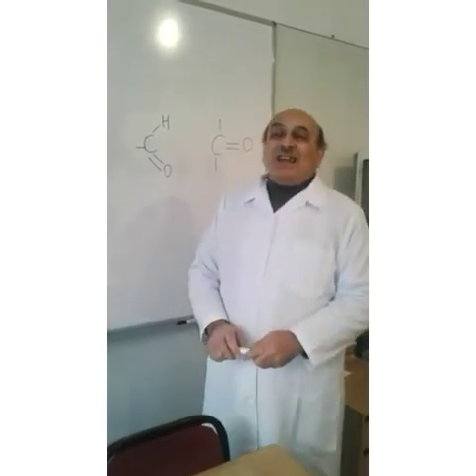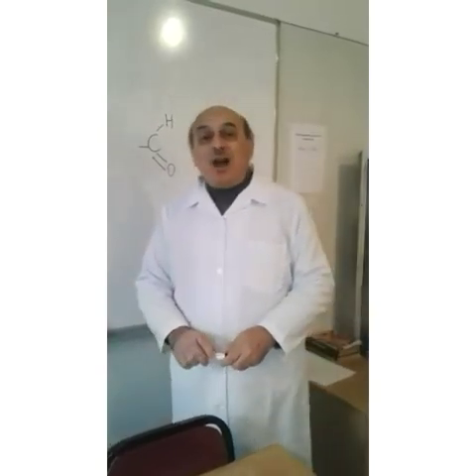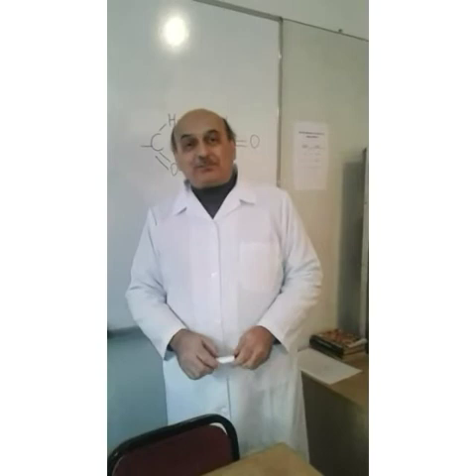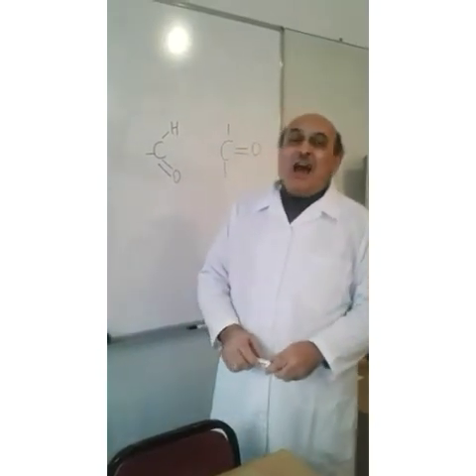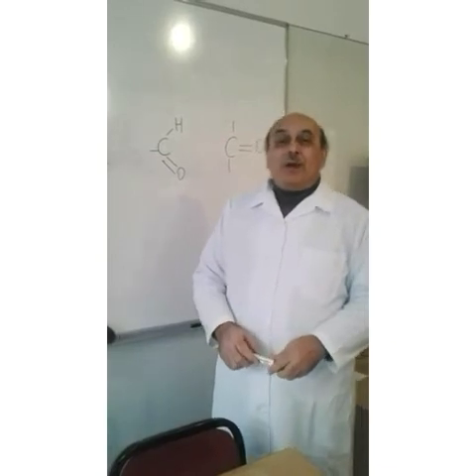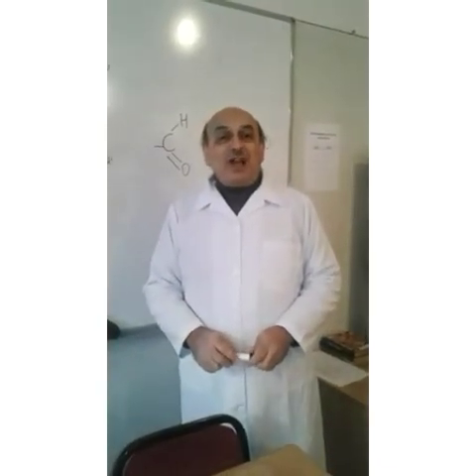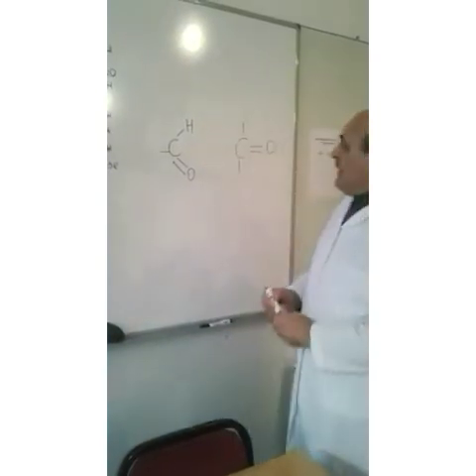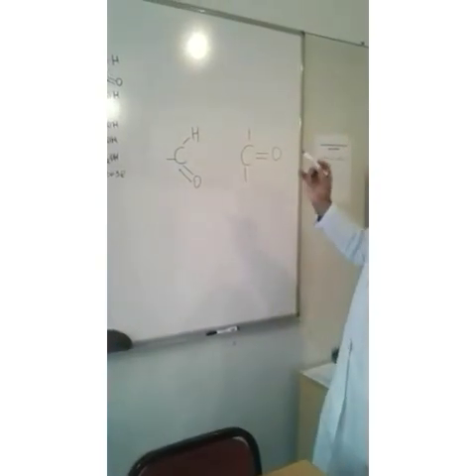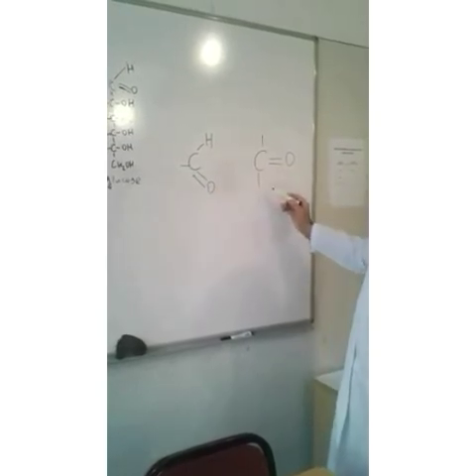This method is based on the reducing ability of carbohydrates on Fehling's liquid. Monosaccharides and some disaccharides, which have free carbonyl groups in their molecule, possess this ability. Carbonyl groups are aldehyde and ketone groups.